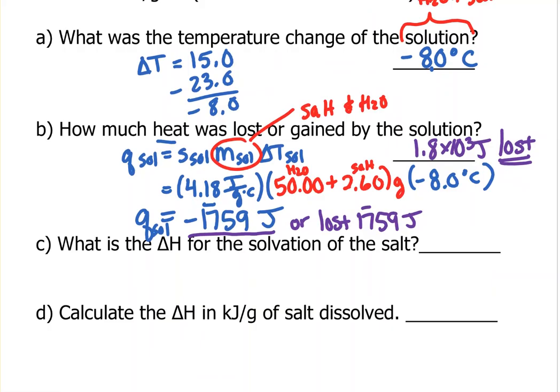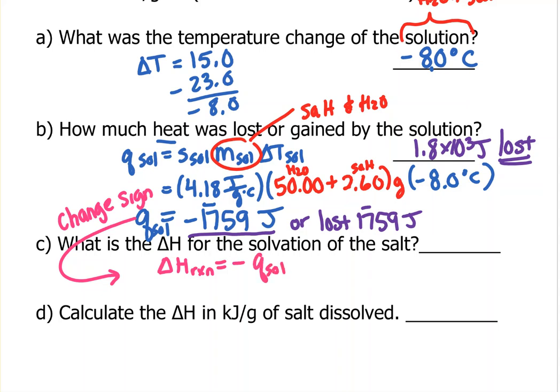Okay, next step. So we're just going to take this and change the sign because the heat of the reaction is equal to the negative of the Q for the solution.